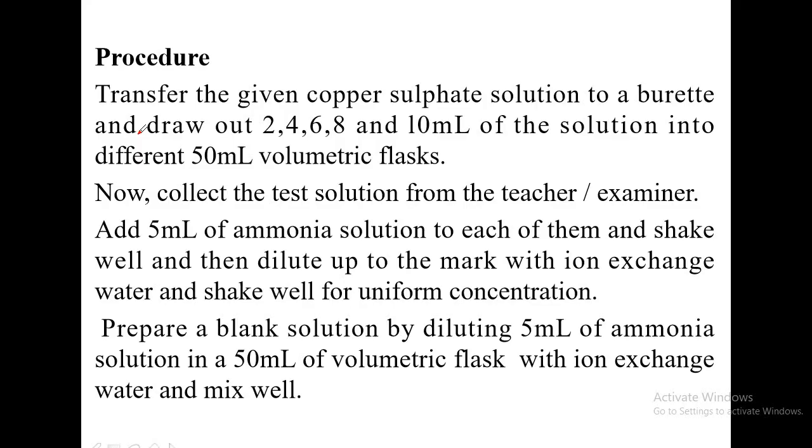Moving on, now the procedure part. In this we are taking first copper sulphate solution, and we are transferring that copper sulphate solution into a burette, and then we are taking 2, 4, 6, 8 and 10 ml of the solution into different 50 ml standard flasks. We have to label the 50 ml standard flasks 2, 4, 6, 8 and 10, and as per the label you have to draw out exactly these volumes into different standard flasks.